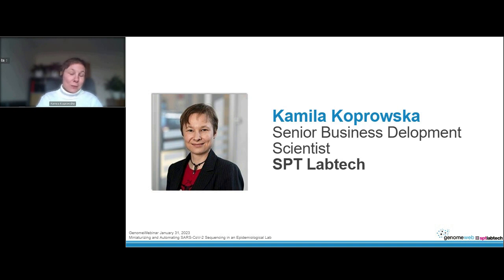Okay, thank you, Quentin. Thank you very much, Richard, for this presentation. I will just go very briefly through the technology that was used and what are the other possibilities of our liquid handlers for the NGS laboratories.